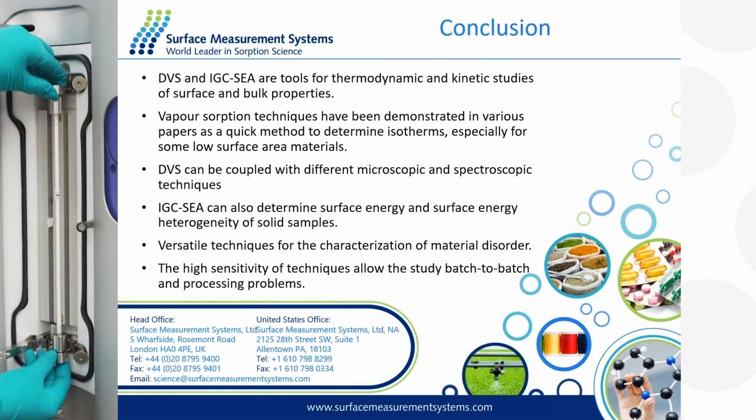But for some hydrophobic samples, like polyester or polypropylene, humidity will have less impact; the surface area will not change at different humidities, and surface energy may not change either. So it depends on the nature of the sample. Does that answer your question, Musab? It does. Thank you very much.